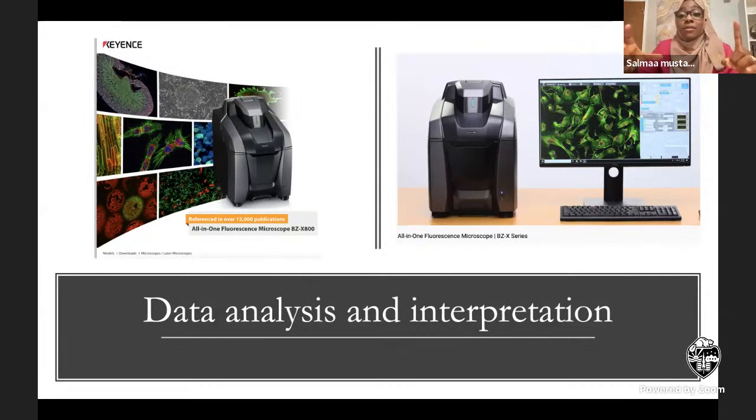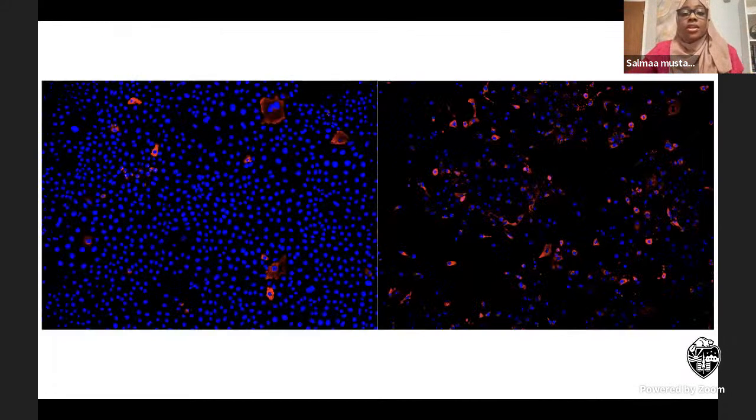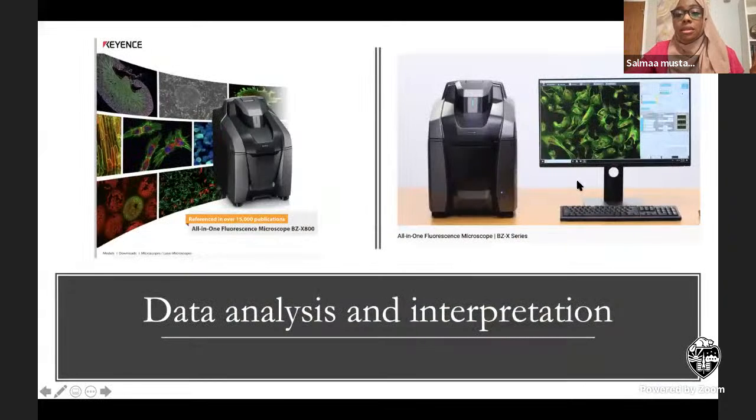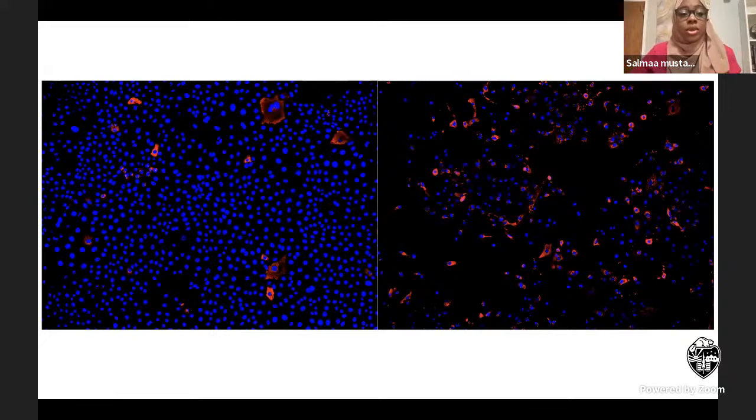When you have all of that information, you're able to plot a graph to show your audience the trend or the tracks that the thing is going through. So this is an example of one of my results from using this plate and this microscope, and this is what I got.